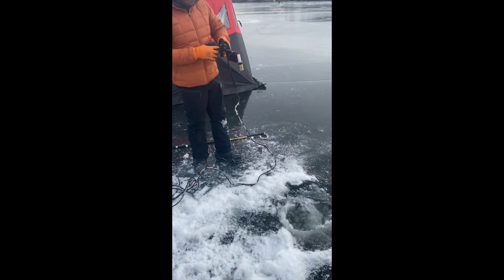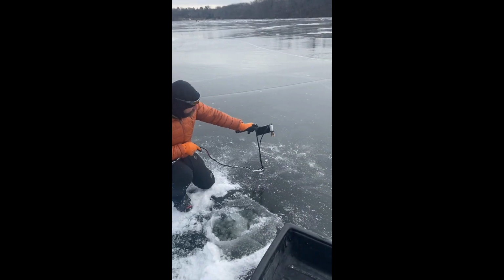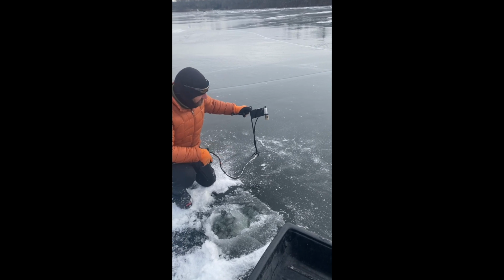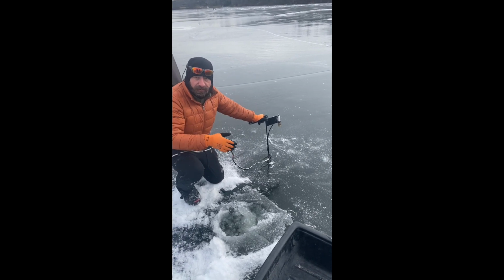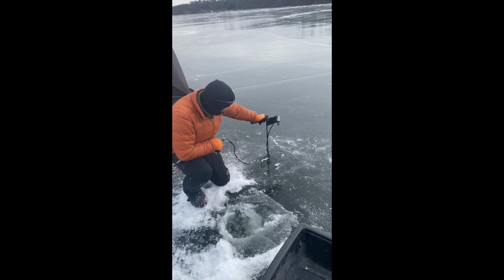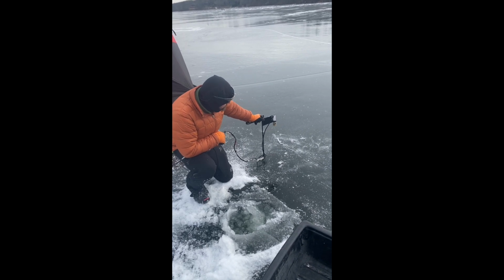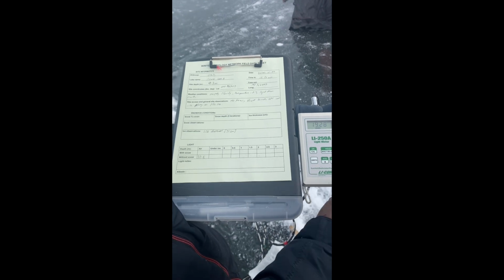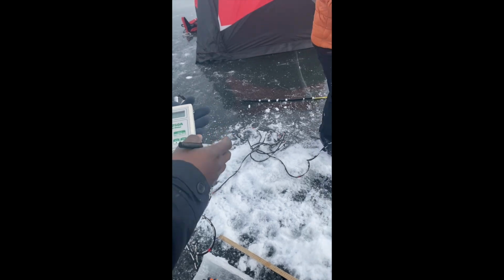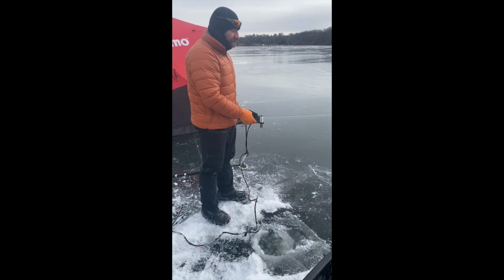Okay, next we're going to collect what we're calling an albedo measurement, which is basically an attempt to measure reflection of the surface of the snow and ice. So if you do have snow, you're going to do it over the snow. Because we have no snow at all, we're going to do it off the ice. So the idea is to just flip the sensor upside down and face the sensor towards the ice or snow. 19.28.